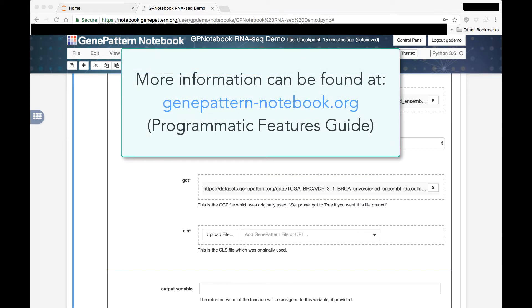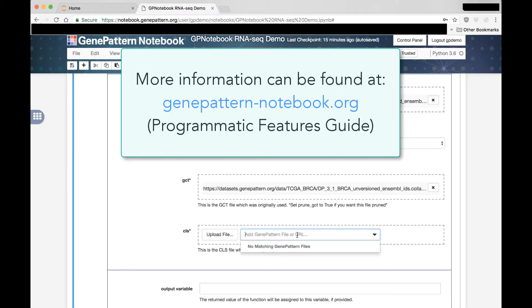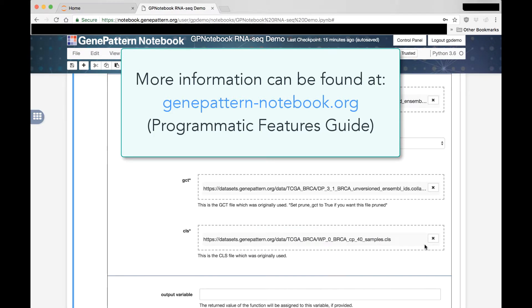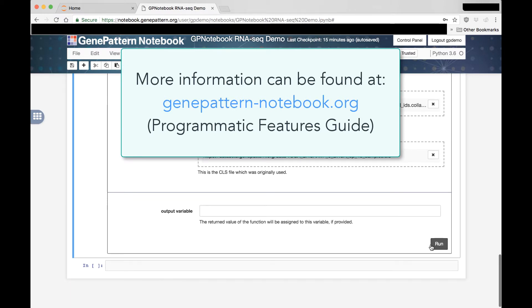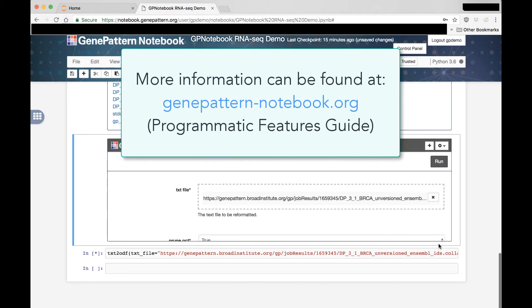More information about the UI Builder and all of its refinements and capabilities can be found on the GenePattern Notebook website, GenePattern-Notebook.org, in the Programmatic Features Guide.